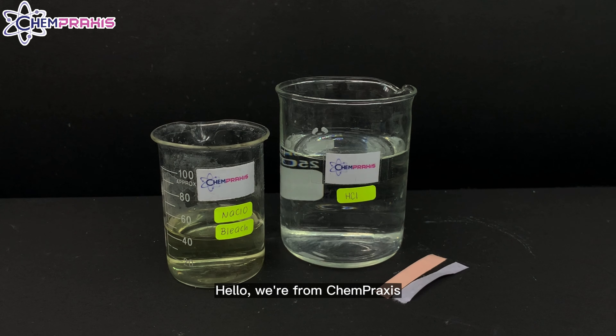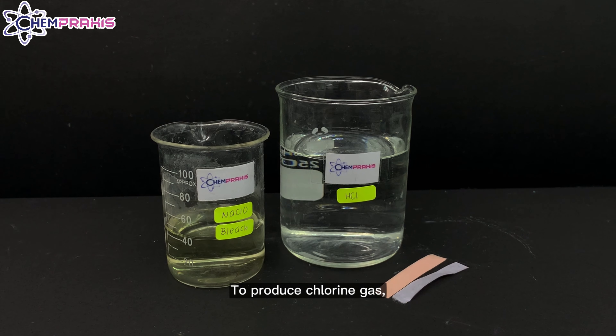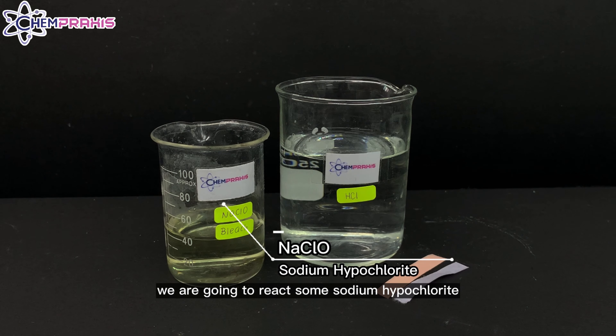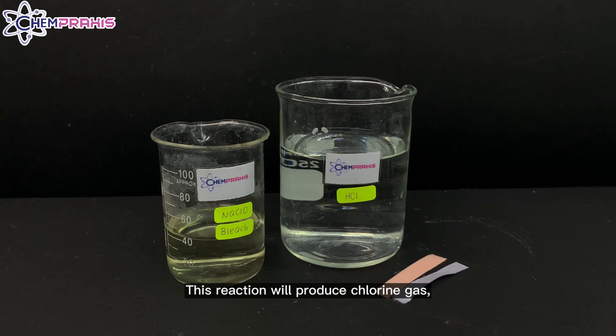Hello, we are from Campraxis. In this video, we are going to test for chlorine gas using some damp litmus paper. To produce chlorine gas, we are going to react some sodium hypochlorite with hydrochloric acid. This reaction will produce chlorine gas, water, and sodium chloride.